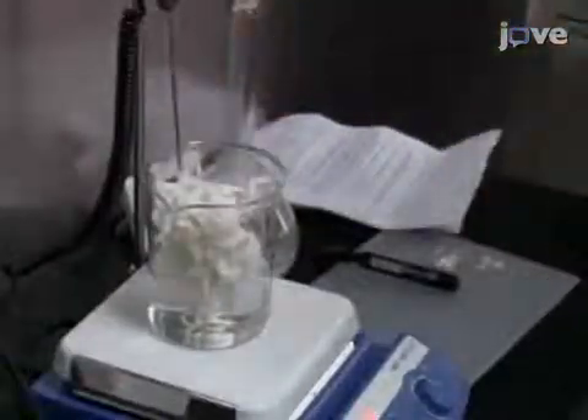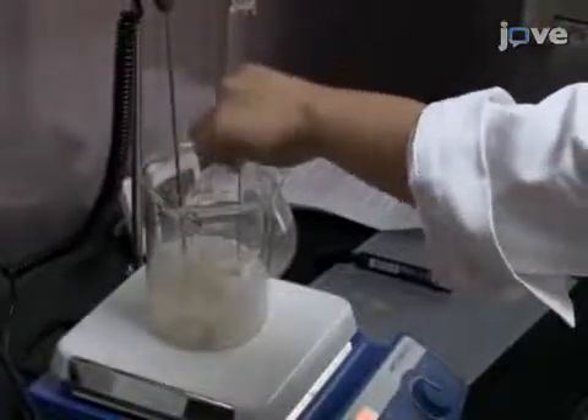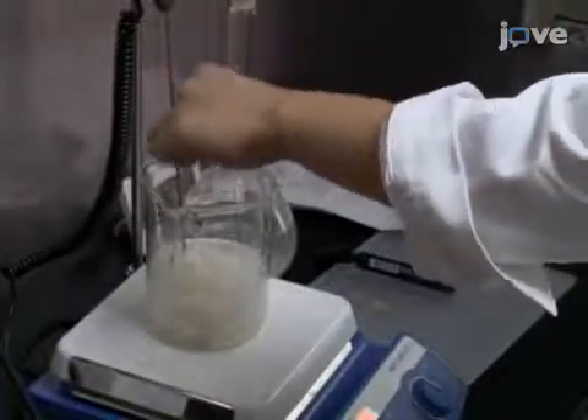Dry the degummed cocoon silks in air, then submerge them in 9.0 molar lithium bromide at a weight-to-weight ratio of 1 to 10. Incubate the silks at 40 degrees Celsius.